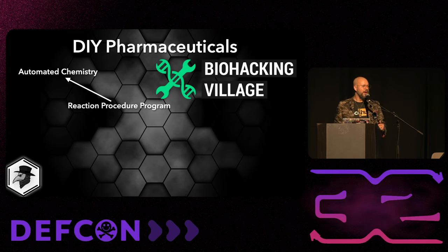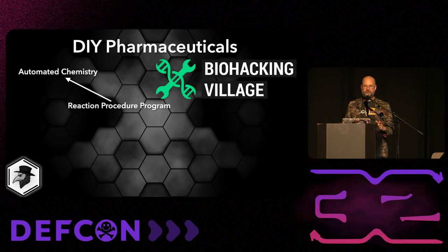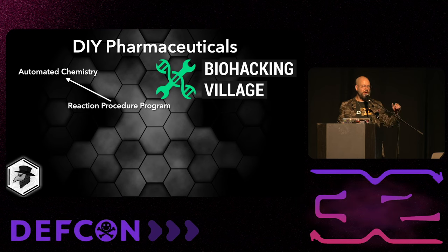Antecedent to that, you need to be able to write the programs that the hardware will actually run. This is the recipe press, which you'll also see. And this allows you to stack a procedure together and get code into the machine so that it can execute the procedures that you want to do.